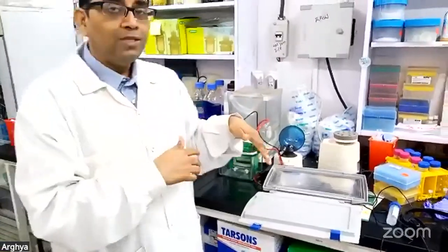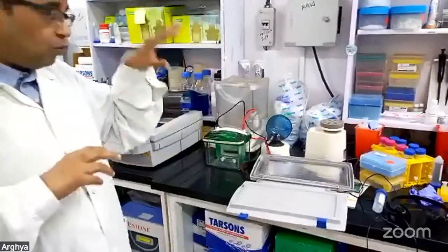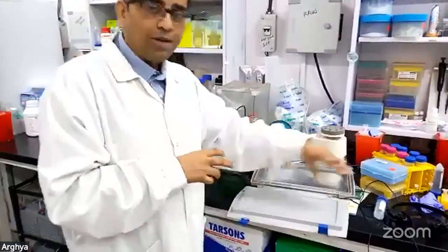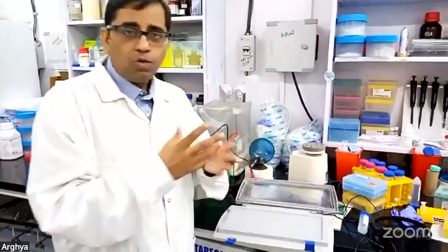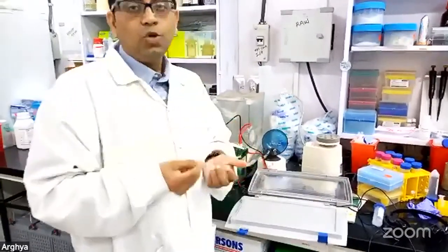But in the 2D gel, we don't have that opportunity. So after coming from IEF and before going to the second dimension separation by molecular weight, we always have an in-between step, known as the equilibration step. That step happens in the tray like this, where you place one IPG strip in equilibration solution 1, which contains DTT along with glycerol and Tris, etc. And then solution 2, which will be the iodoacetamide.